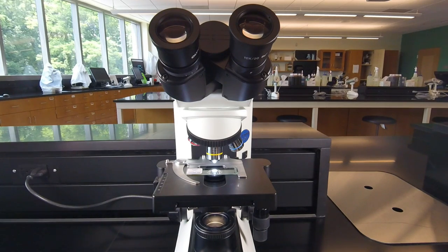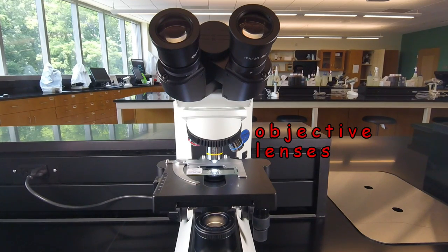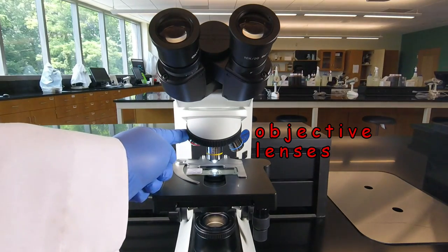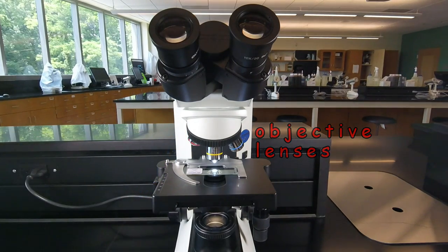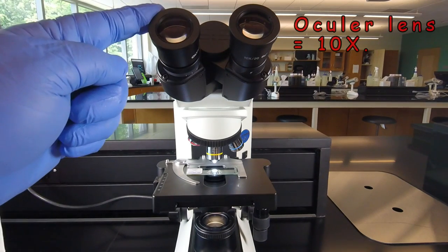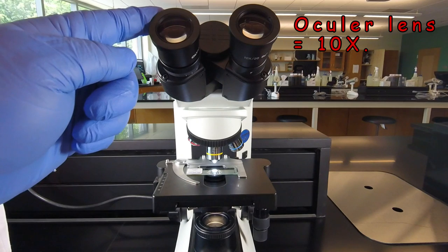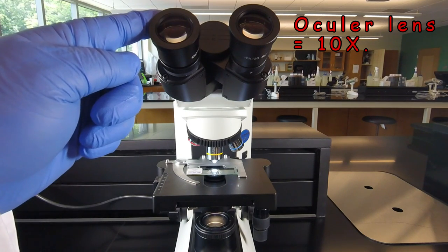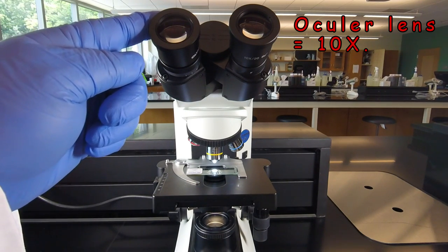To change magnifications on the microscope, we change the magnification of the objective lenses. In compound microscopes, we have two lenses that work as a set. The ocular lens or eyepiece, and that magnifies the image 10 times. That's pretty much standard with microscopes.